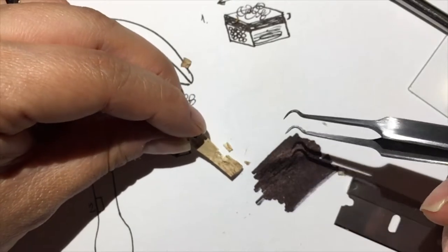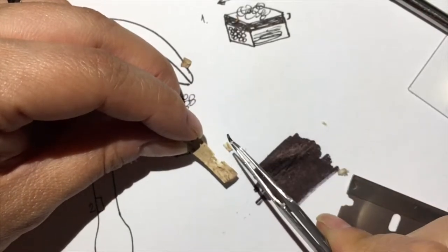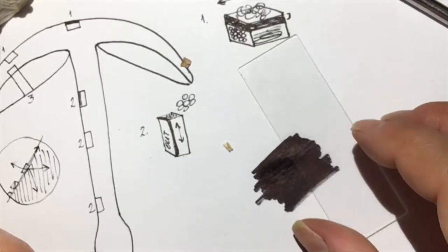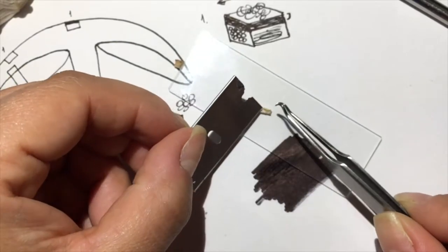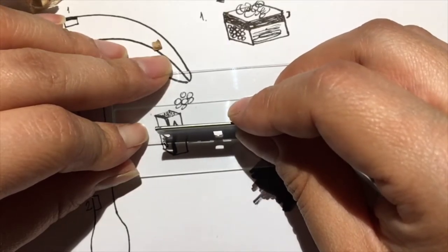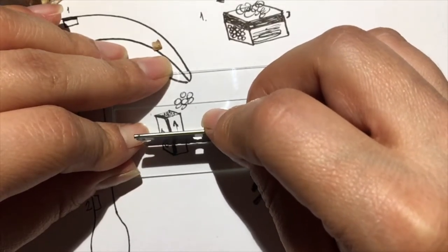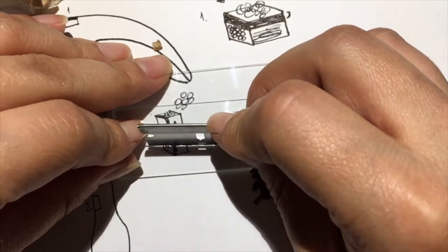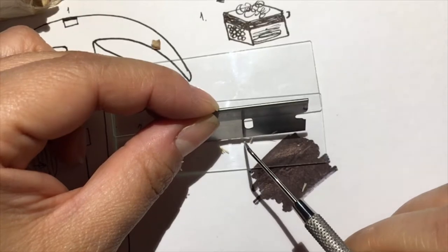And because we want to keep it longitudinal sections, we're going to cut this way. So our blade is going to come down in the same, we're going to be parallel to this and go down. I had to get really low to see what I was doing. A lot of these were super thick.